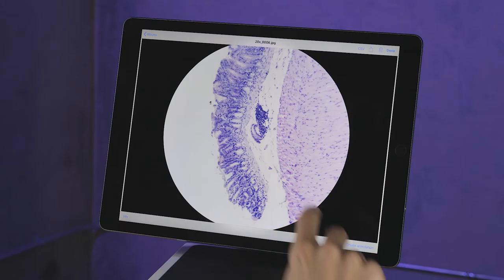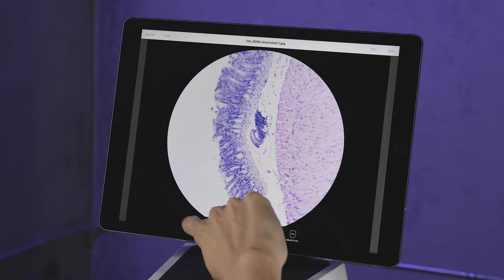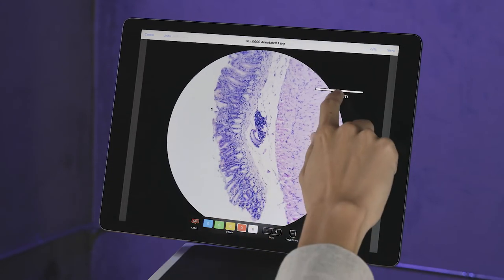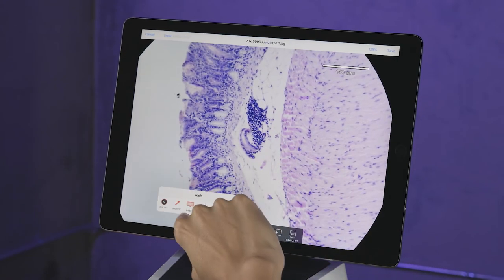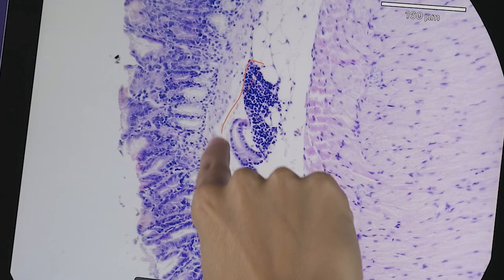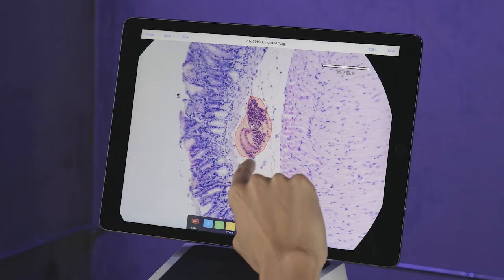Once you've captured your image, we can quickly review them and make annotations. Place the scale bar anywhere you would like, and we can easily take measurements, as well as label our findings.